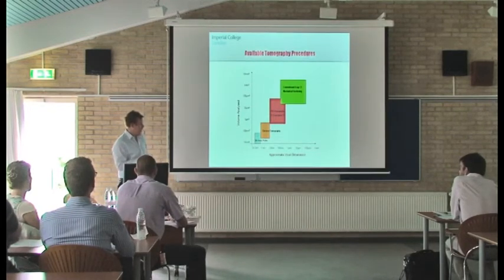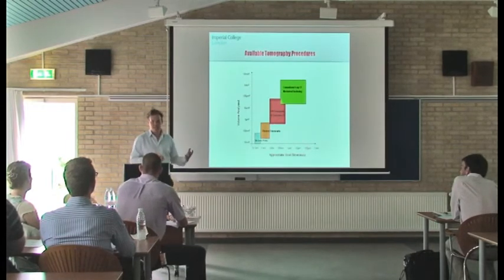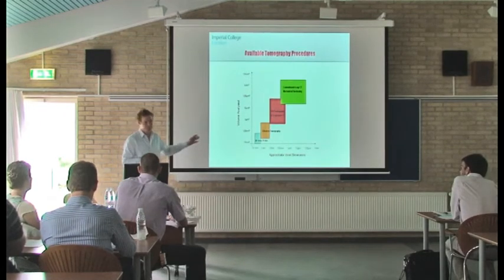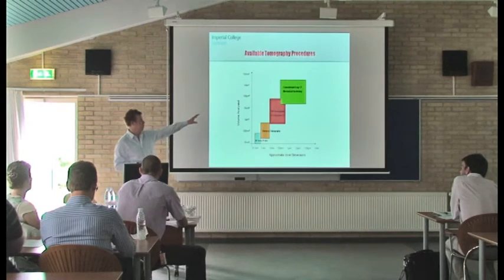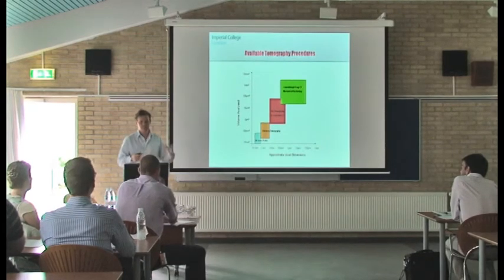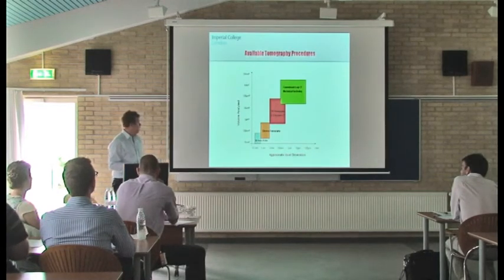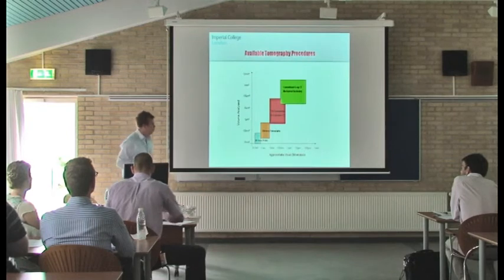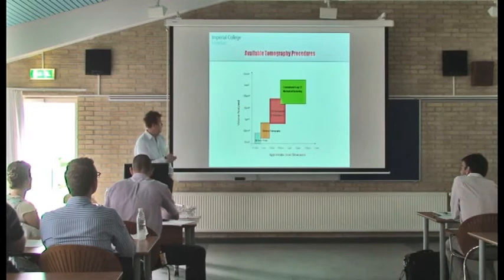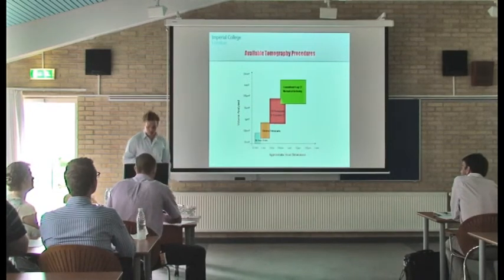Obviously there are advantages to atom probe and electron tomography to study more fundamental stuff, effects at interfaces, and I think that's very interesting work, not something we'll talk about today. And then also conventional X-ray CT and mechanical sectioning certainly has its place in other fields, but perhaps not so much in SOFC electrode studies. So I think the red area represents the area we want to be, and for me that's focused ion beam tomography and X-ray nano-CT. X-ray nano-CT being distinct from conventional CT, and I'll talk about that as well.